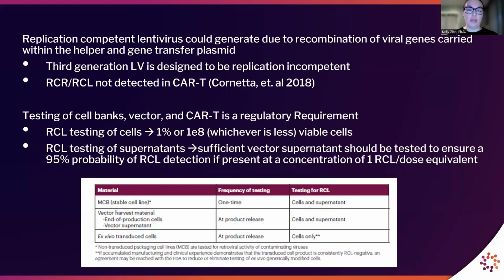So in other words, the recommendation is that you test the volume of vector that would be administered in 1 CAR T dose, and that's based on the lentiviral vector volume used at T cell transduction. The required testing for RCL at each step of the vector and CAR T manufacturing process can require a significant input of time, material, and funds. So it's really important to plan early for the impact of RCL testing on your sample plan and your batch yield calculations.